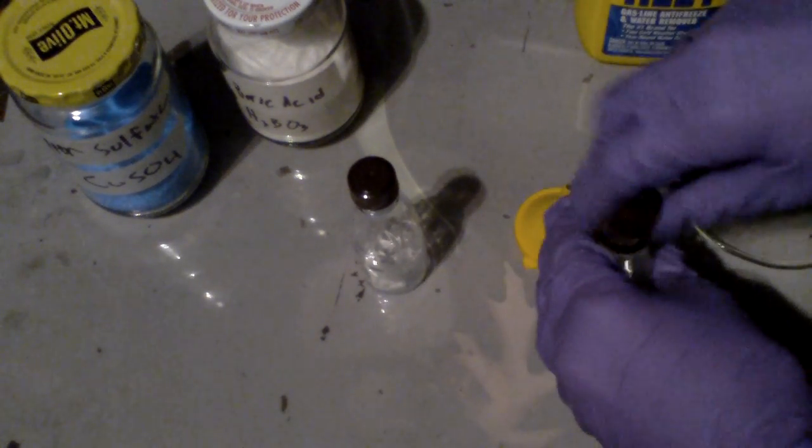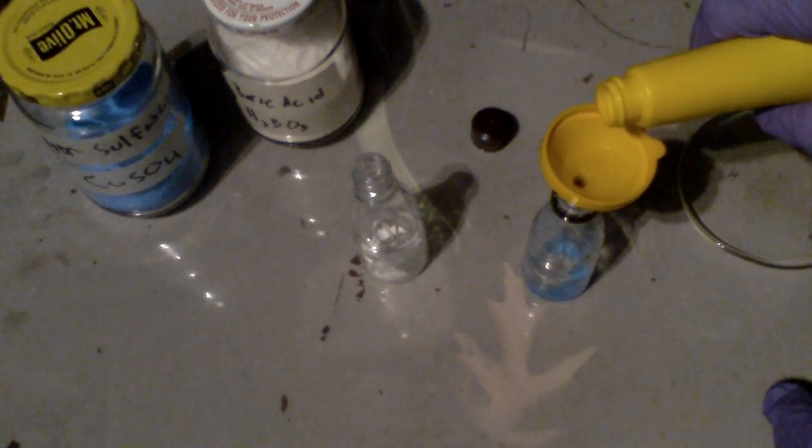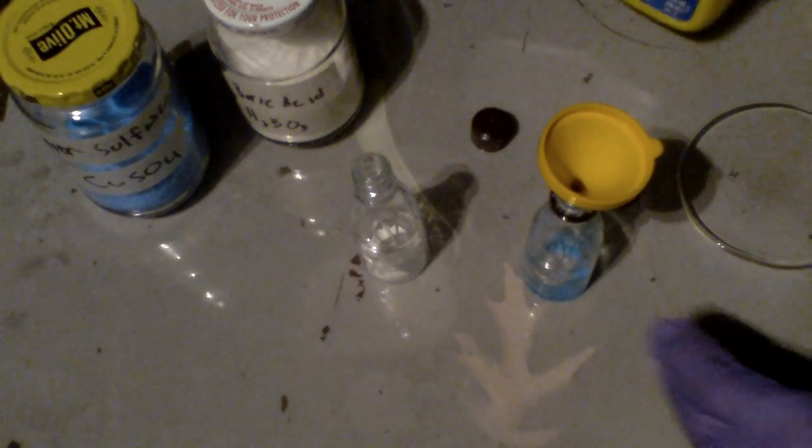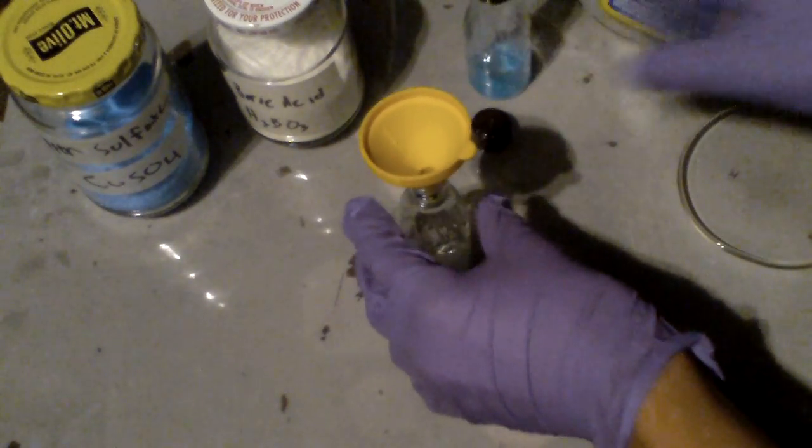Now open up your jars and add a small amount of methanol into both of them. It doesn't have to be that much. Then do the same for the boric acid.